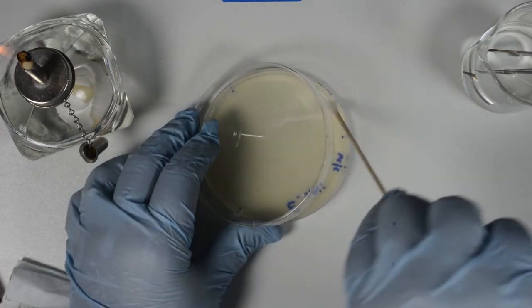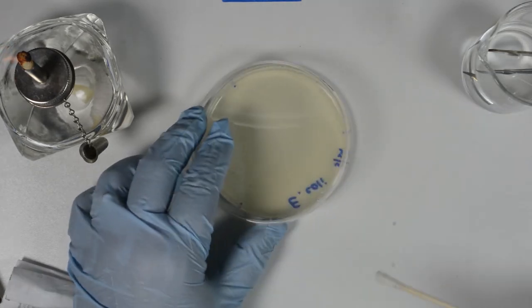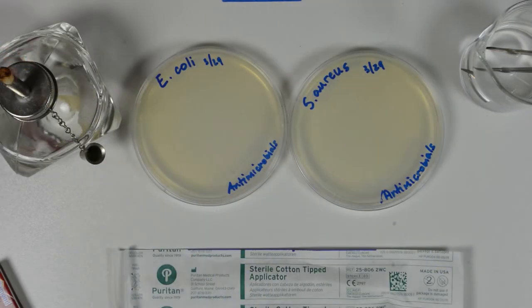Discard the swab into the biohazard container. Turn off the Bunsen burner. Let the plate stand for about 3-5 minutes to let the surface of the agar dry. We will prepare one plate for E. coli and one plate for Staphylococcus aureus to assess the sensitivity of bacteria to antimicrobial agents, including disinfectants and antiseptics commonly used in household and healthcare settings.